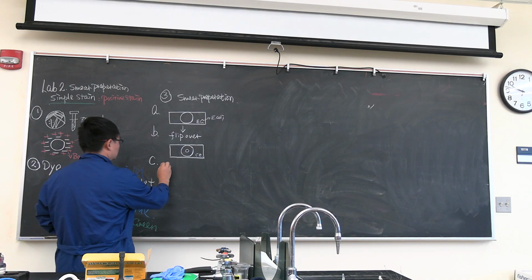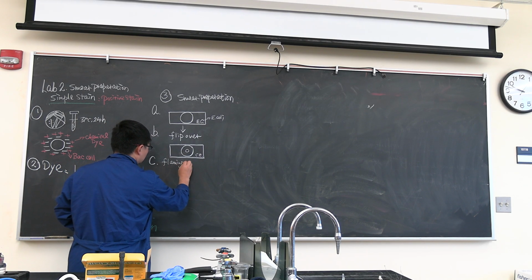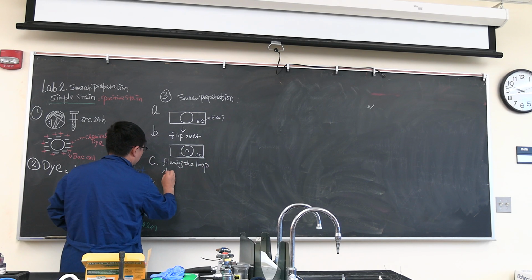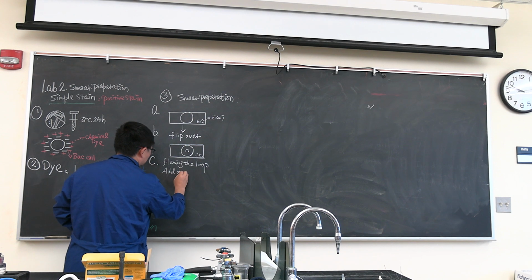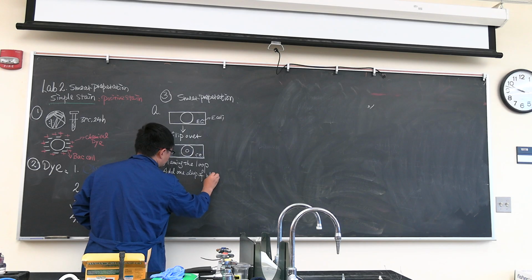So this will be flaming the loop. Add one drop of water.